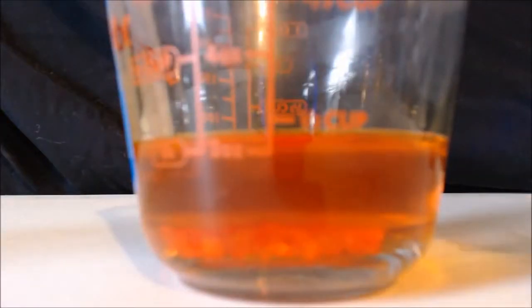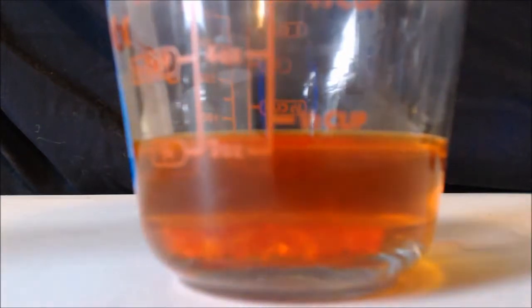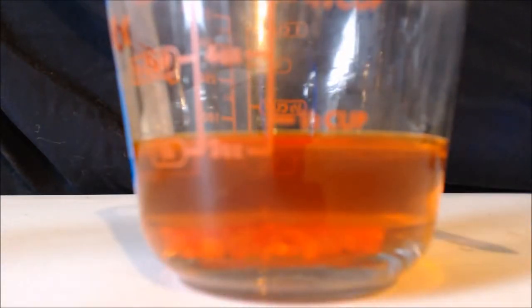You can see it's turning more orange, and eventually it'll turn a red. So we're just going to let that dissolve, and we'll get back to you.